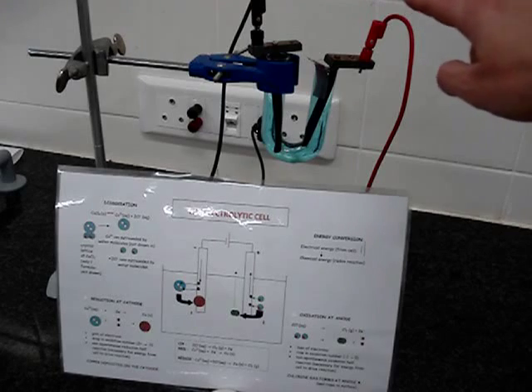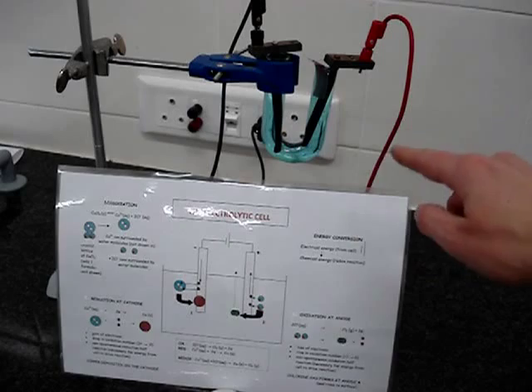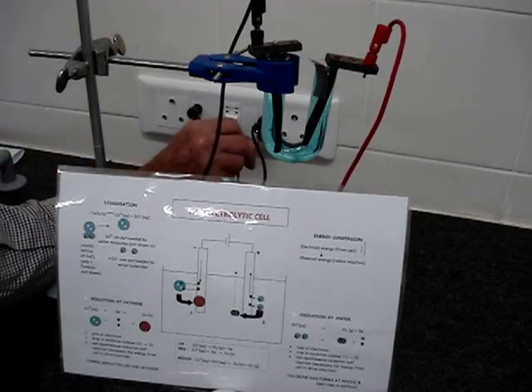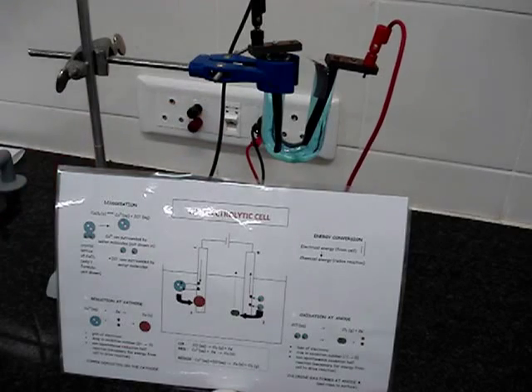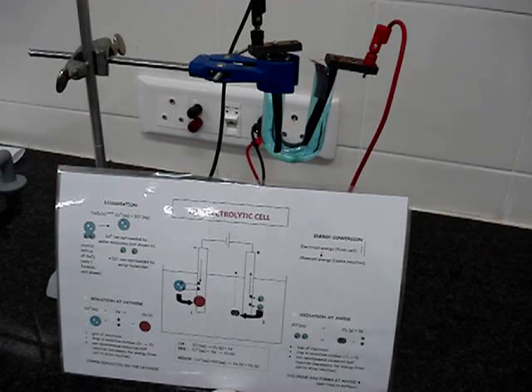The positive terminal is not yet connected to the power source, but we're going to connect it now. And so when we connect that to the power source there, then current can flow because here we have an electrolyte. It's copper chloride solution, and that can conduct electricity because it's an ionic solution.